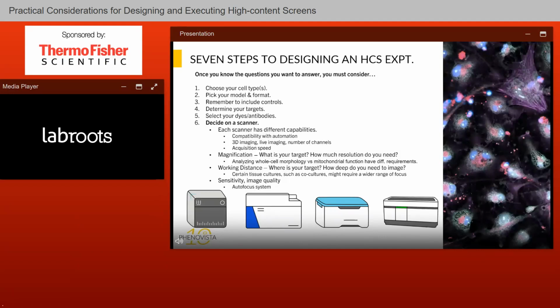available. There are other ones out there too, and each of them has its strengths and weaknesses, but they're pretty similar to each other, to be honest. It really comes down to what kind of workflow you're trying to support, and sometimes the resources that you have within your company as far as downstream bioinformatics capabilities and things like that.